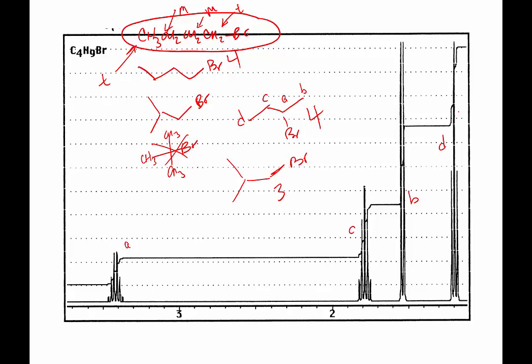So that puts together our integration. It puts together our splitting patterns, but more importantly, it puts together also our chemical shifts. So that's where we're at.